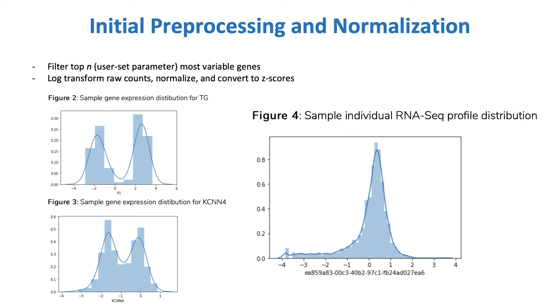The first step in processing the RNA-seq data is filtering for the topmost variable genes, then taking the log transform, normalizing, and converting to z-scores. On the left, you can see the distribution of normalized expression for the topmost variable and the least variable gene in the resulting dataset, respectively. And on the right, you can see the expression distribution of a single individual for all the filtered genes.